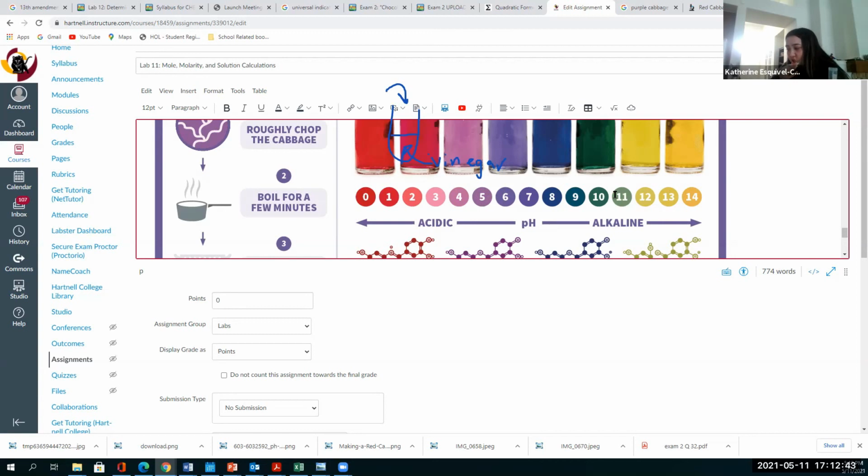And then we add the baking soda. Okay, now pour that out completely, and then put baking soda in fresh and put in some water, 5 mils of water. Okay, so water. How much baking soda? A quarter of a teaspoon. A quarter. Yep.